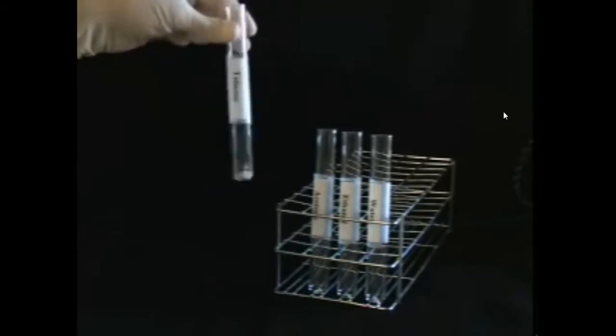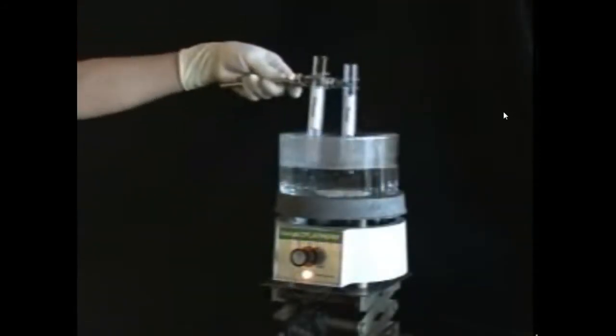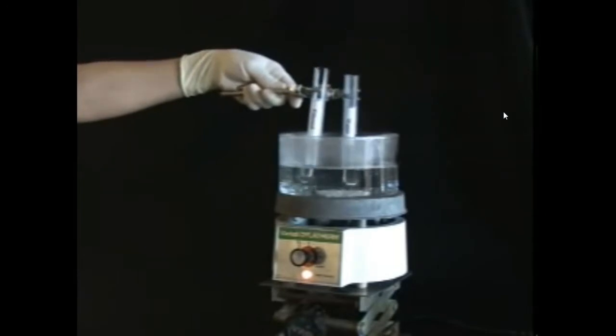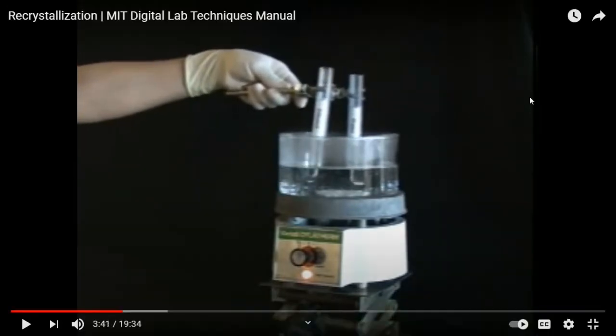To perform a solubility test, place approximately 20 milligrams of your compound in a test tube. Add a half of a milliliter of the appropriate solvent and swirl. Wait a couple of minutes and then make note of whether or not the compound dissolves. For example, at room temperature, naphthalene is insoluble in ethanol and water, but soluble in toluene and acetone. If there is still solid remaining, clamp the tube and heat it in the water bath until the solvent boils.